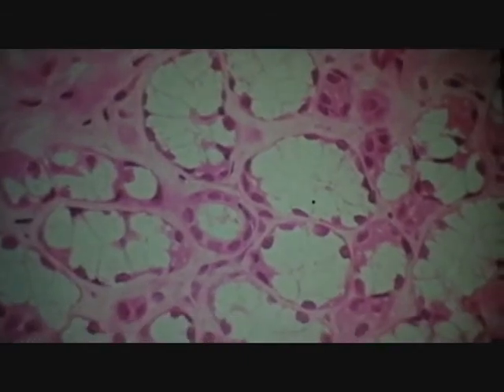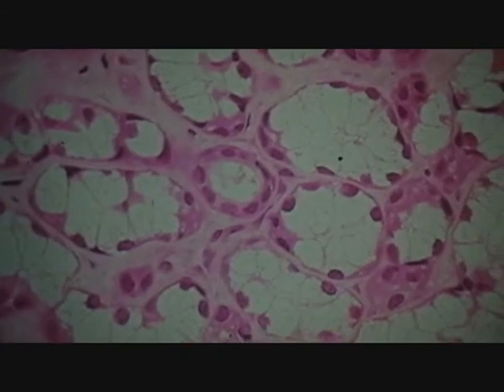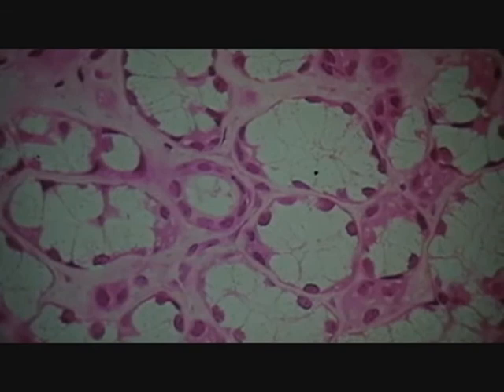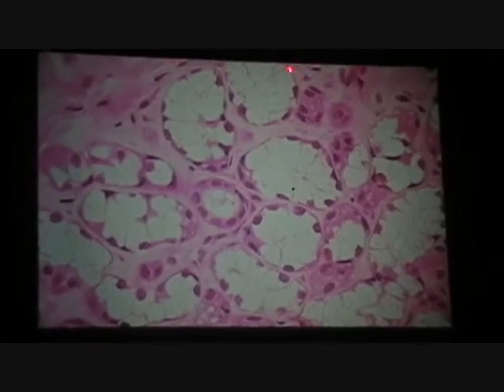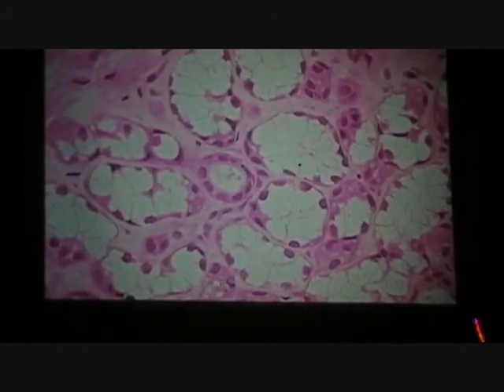Okay. Name this salivary tissue. So what are you going to go with? Or which of the three salivaries? And then you're thinking, do I see all serous? Do I see almost all serous with a little mucus? Or do I see a lot of mucus? Yeah, a lot of mucus. At least half of it. These are serous. Half of it are mucus cells. Gotta be sublingual.